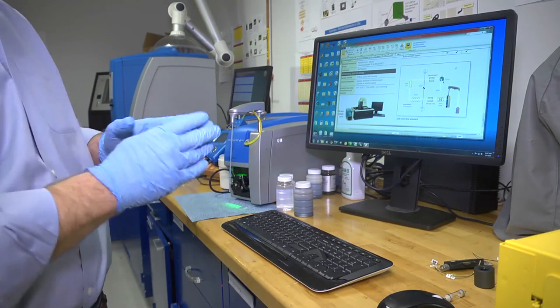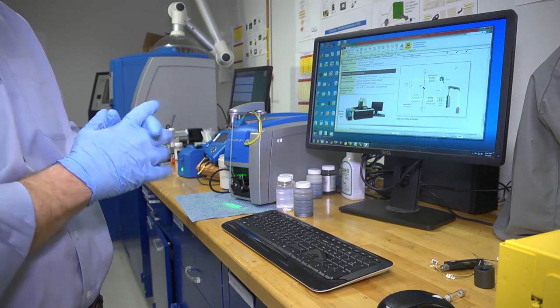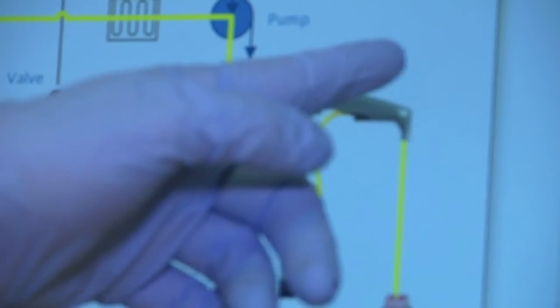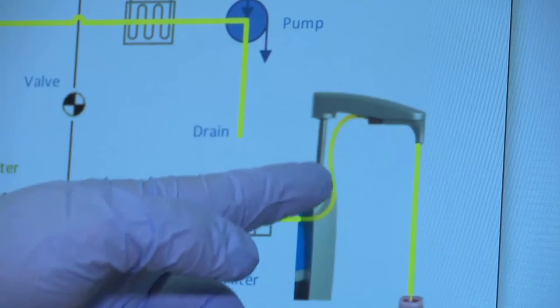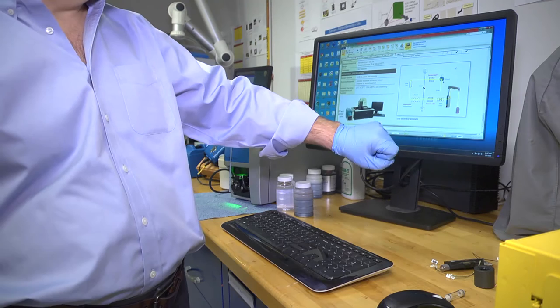Before we begin, I'd just like to point to the schematic briefly and explain what the components are. The sample is drawn up through a zipper tube, passes a 100 micron filter which filters out large particulate, and passes into the instrument.